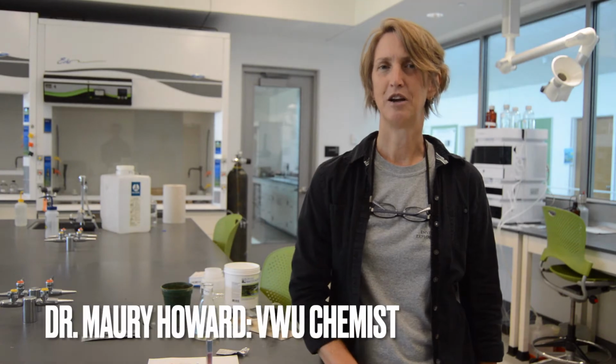Hi, so I'm Dr. Howard. I am an analytical chemist, and I work a lot with the Earth and Environmental Science Department here, running samples for them, looking at nutrients in water samples. So we're often interested in monitoring nutrients in natural water systems to ensure that the levels don't get too high.